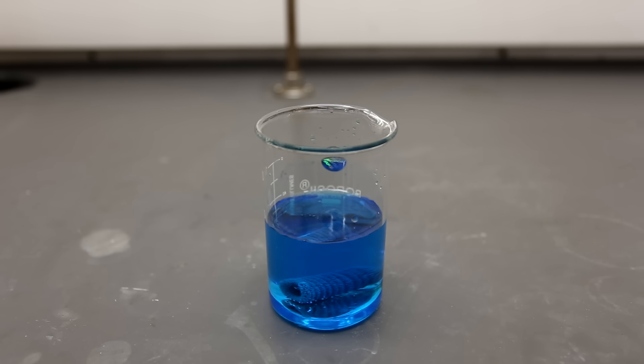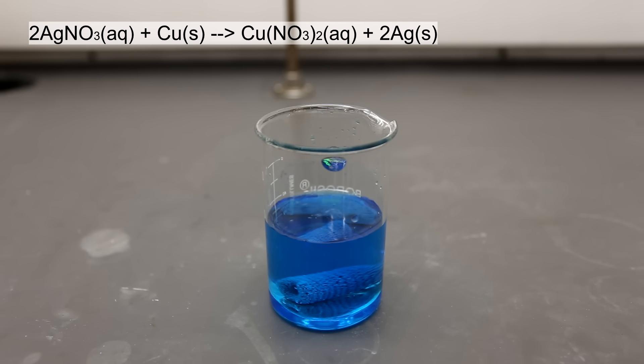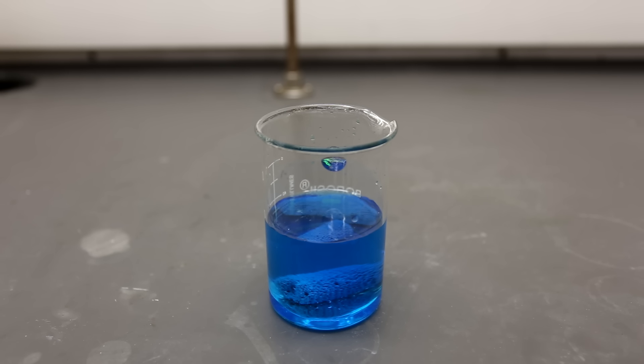Copper wire was then added to the solution and it starts reacting. The reaction taking place is shown above — the copper reacts with the silver nitrate in solution to displace the nitrate ion and release silver metal. Another reaction that is occurring is the reaction between copper and excess nitric acid. For this reason, it's important to add an excess of copper in order to precipitate as much of the silver as possible.